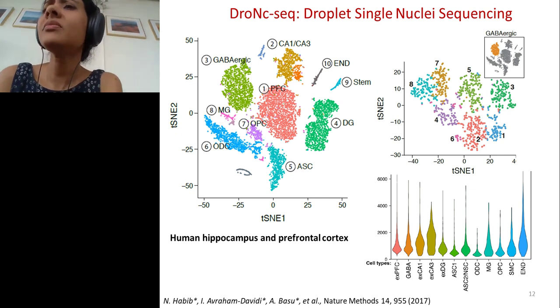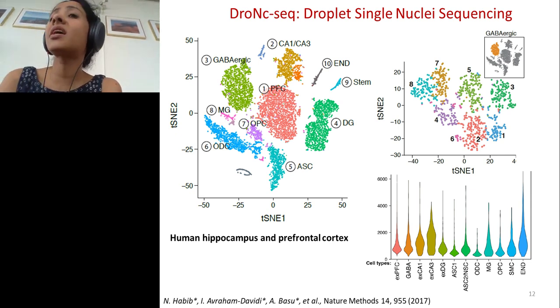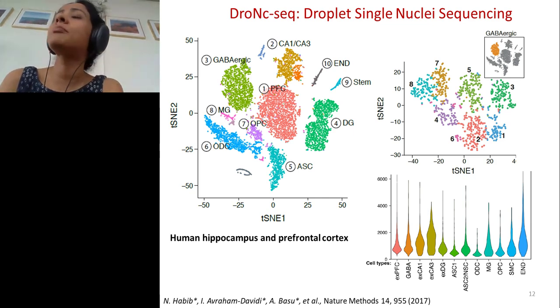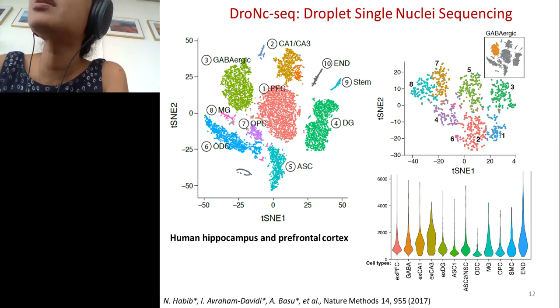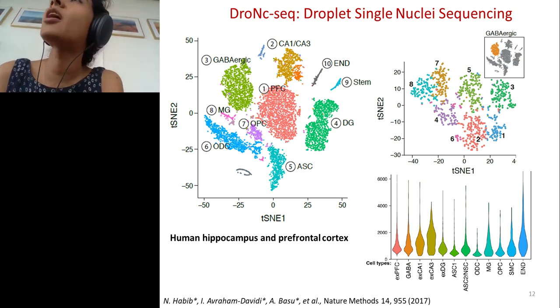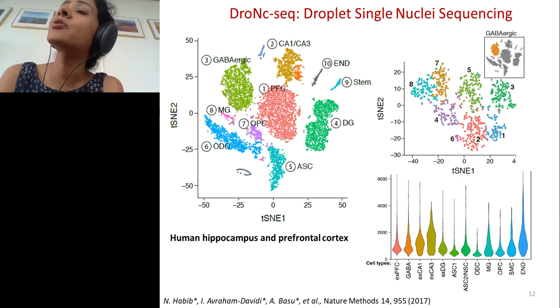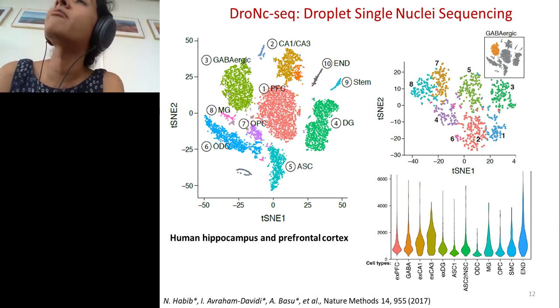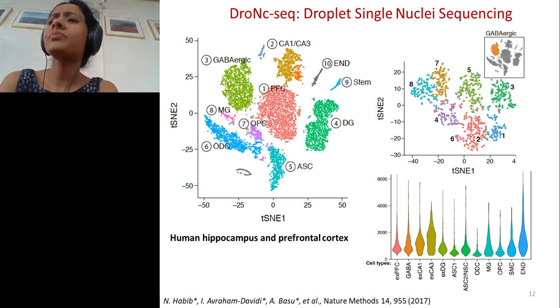I should point out that if you take any one of these big blobs, so for example, in the TSNE plot to the left here, the green blob, and if we perform hierarchical clustering on these, you can find out even finer structures in a given blob and identify finer subtypes within a given cell type in the tissue.